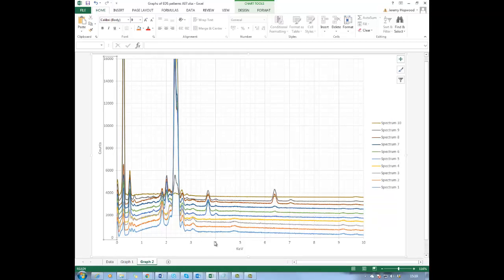So one of the issues is that it starts off quite well, but then here I think my grey is kind of close to the yellow here, and then this one here, this grey here, is close to this sort of browny one here. So it looks like really I could do with changing these again to these offsets.